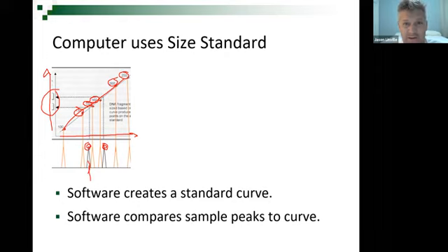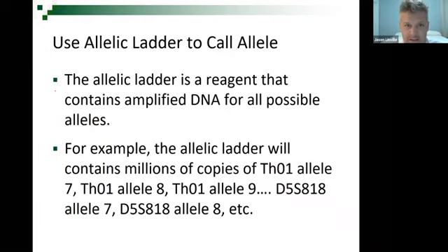That allows you to understand that a sample can't be 147.26 base pairs. It's either 146 or 147, but again, it's just an estimate. The way you can visualize it is just a round number. Today on this instrument, it's a 196 base pairs.